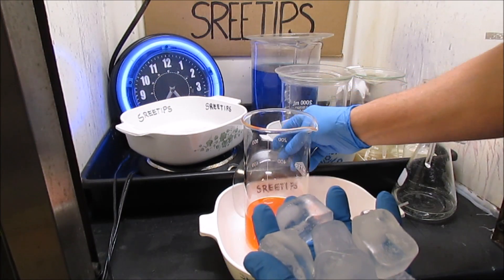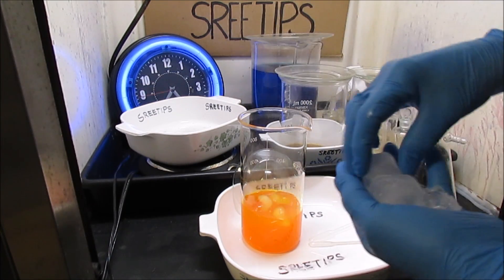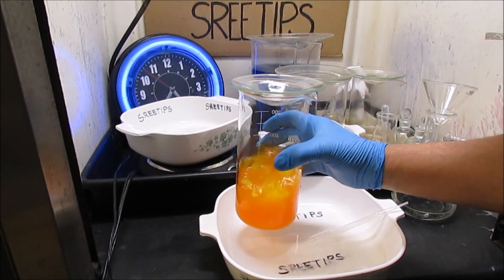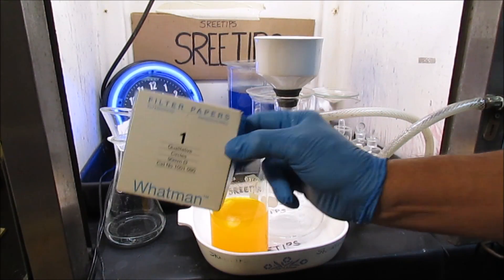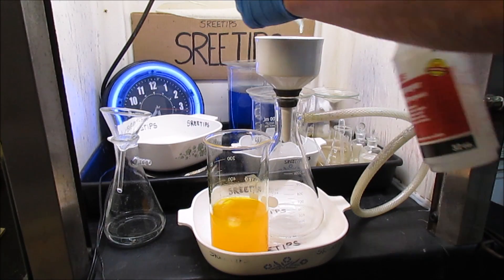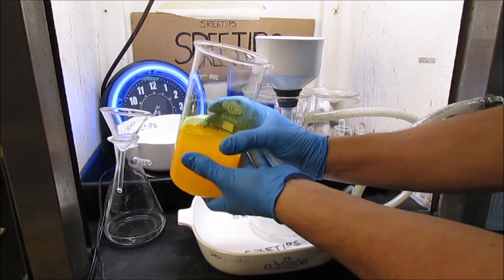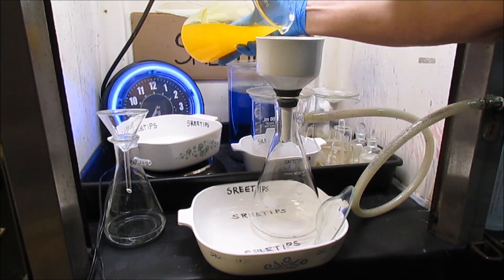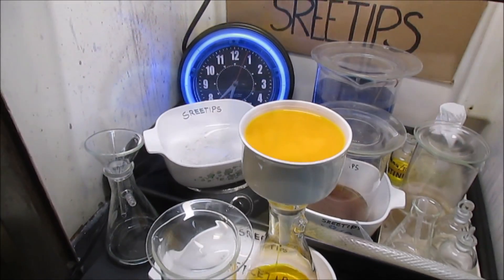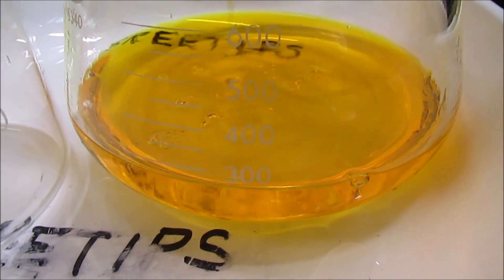I'm going to add some ice cubes to cool the solution off so we can filter it. I've got a Whatman number one fast filter paper in the funnel. I'll go ahead and filter the solution again. Notice how cloudy the solution looks — that's from the filter paper that disintegrated while we dissolved the gold in aqua regia. This is how the solution should look after filtering: crystal clear with no traces of cloudiness. That's exactly what we're looking for for high purity gold.